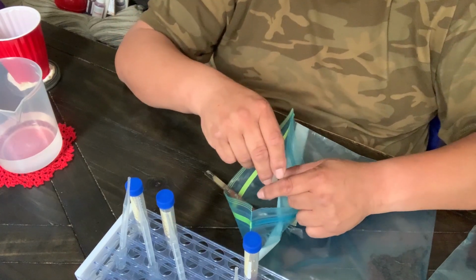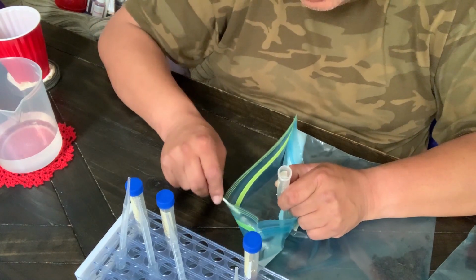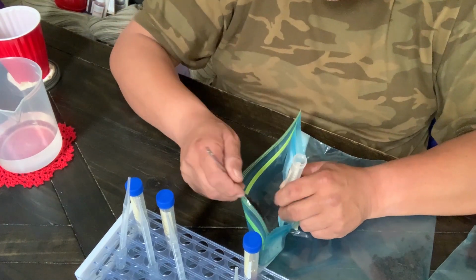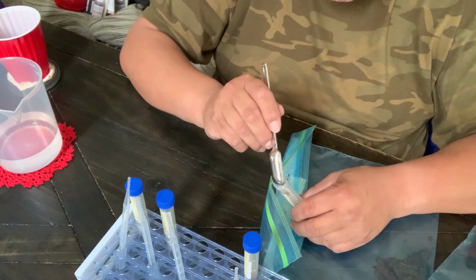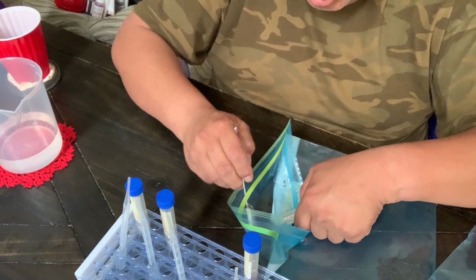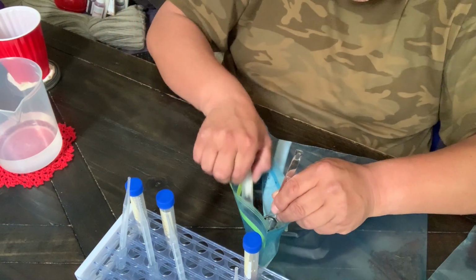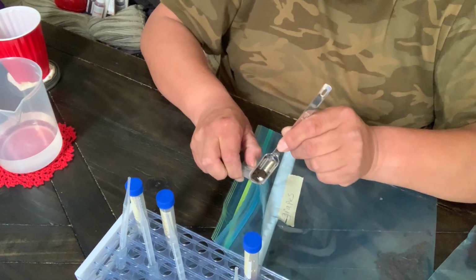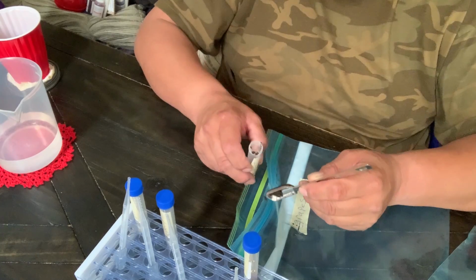We take our test tube, and we're just going to pour it in there. I think I compacted that. Yep, it's compact. I think it's just easier to push it in there. Now, we don't need a whole lot, just a little bit.